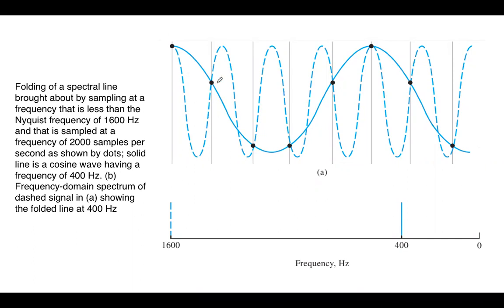The dashed line is the signal produced by the relaxation of the dipole moments of the nuclei that we're interested in. So since it is continuous and it has one amplitude and one wavelength, it gives one signal here. And of course, because it's a frequency domain spectrum, we can still detect the pulsing signal, the signal which is used to probe it.